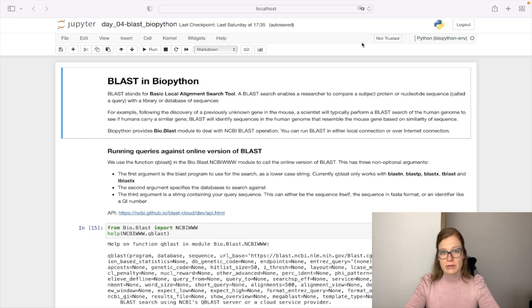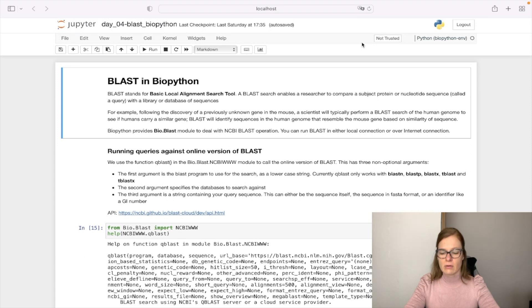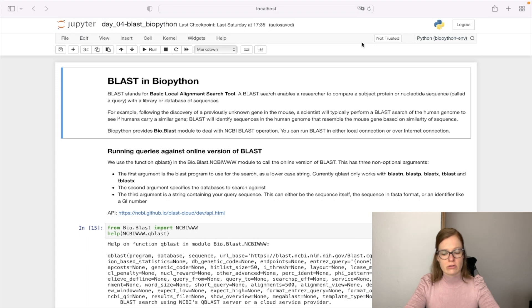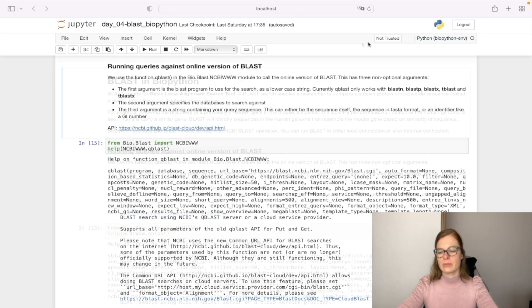Biopython provides the bio.blast module to deal with NCBI BLAST operations, and in this video we focus on how to run queries against the online version of BLAST.